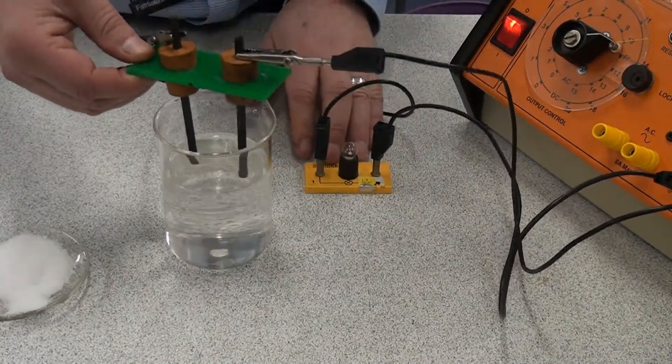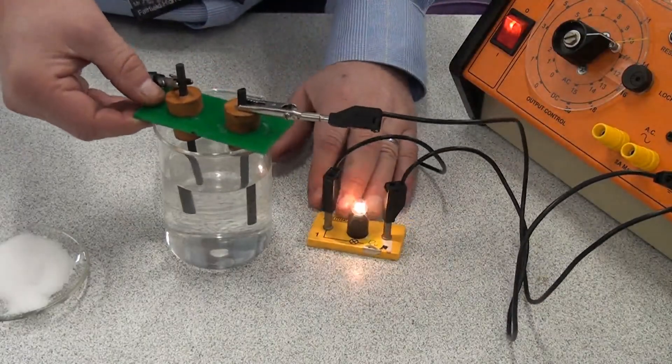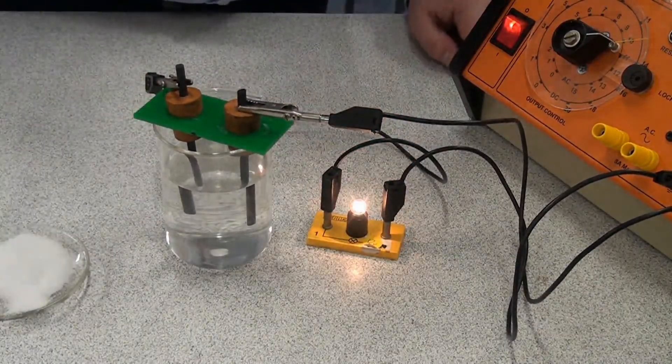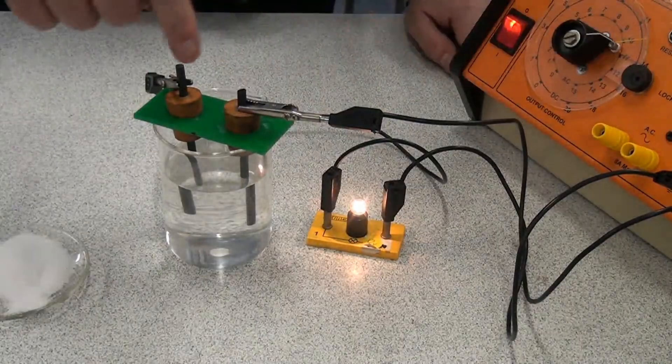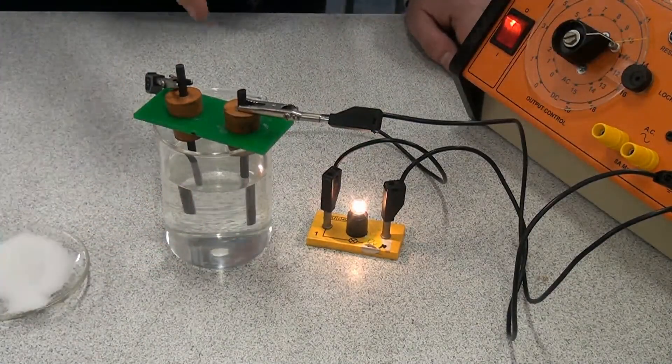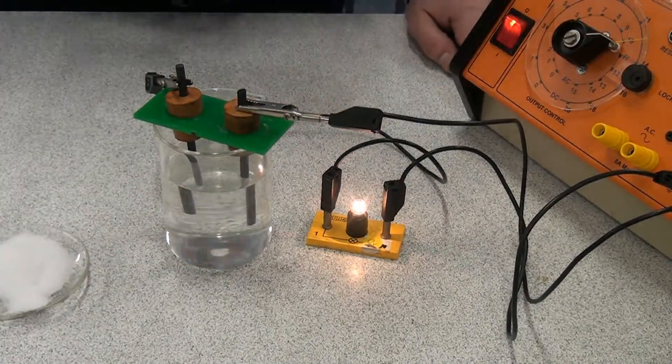So the electrodes are going in. And as you can see the bulb's lighting up. So electricity, the current is flowing down the wires. It's flowing across the solution and making the bulb light up.